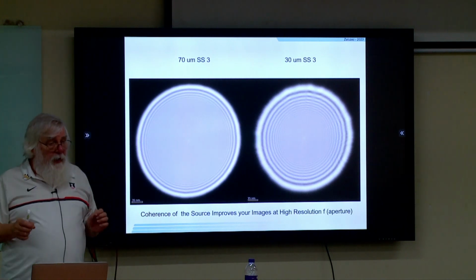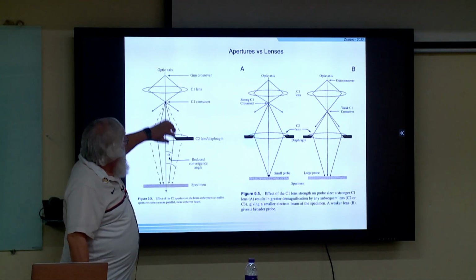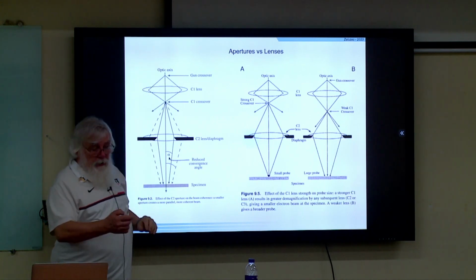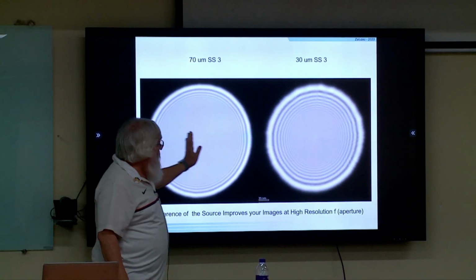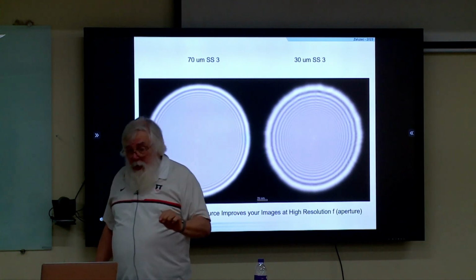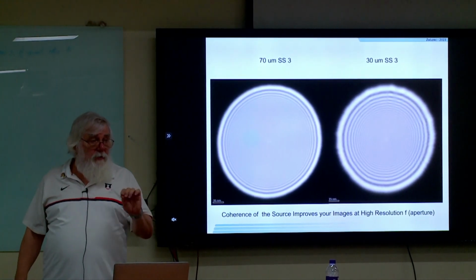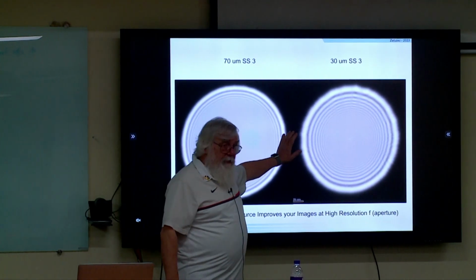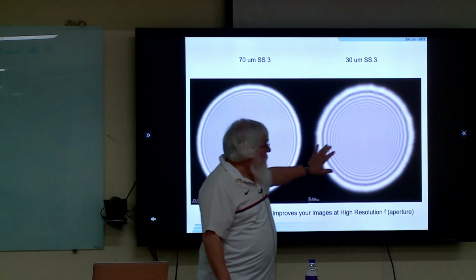But it's very important to realize that as the probe gets smaller, and as the area from which you take the electrons from the source gets smaller and smaller, the probe gets more coherent. So in addition to being Fresnel fringes, these are also a measure of how coherent the beam is. The more coherent the beam is, the higher resolution image you will get in your TEM image. So we can go from a large probe with a lot of current to a smaller probe. We can also go from a less coherent probe to a more coherent probe.